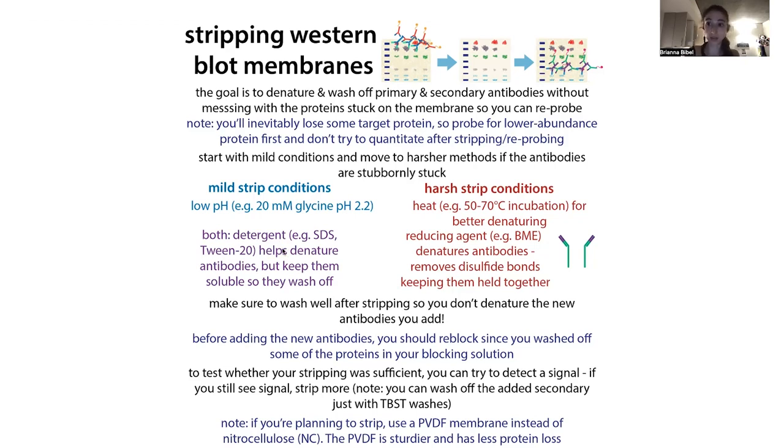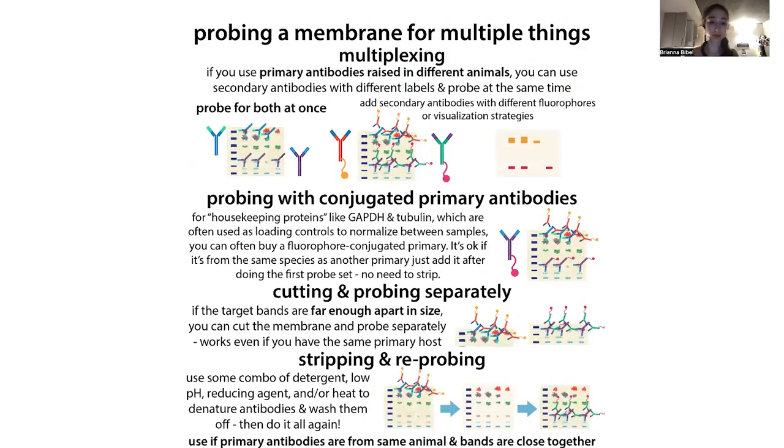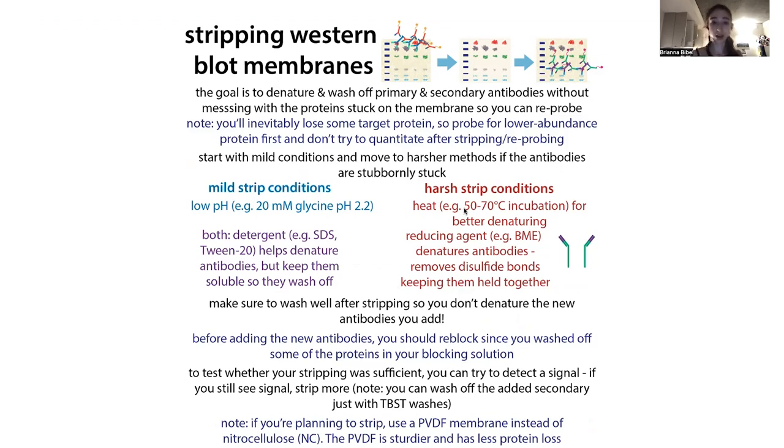This is one of the reasons why we use SDS to run the gel: it's going to coat the proteins once they're unfolded and allow them to travel through the gel in soluble form rather than clumping up with one another. Detergents can do this because they have hydrophilic parts and hydrophobic parts, so the parts that water likes and the parts that water won't hang out with. So it's able to help keep them soluble, and then we can wash things off.